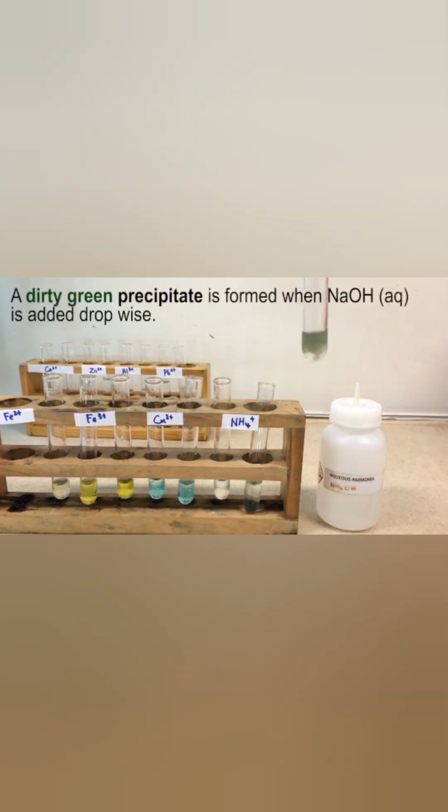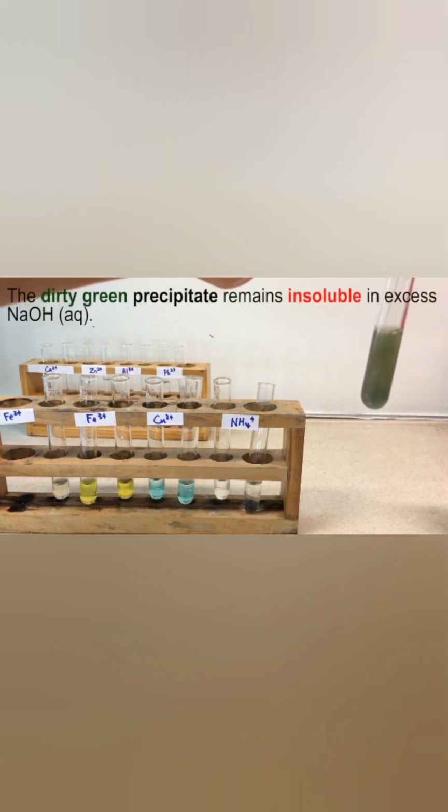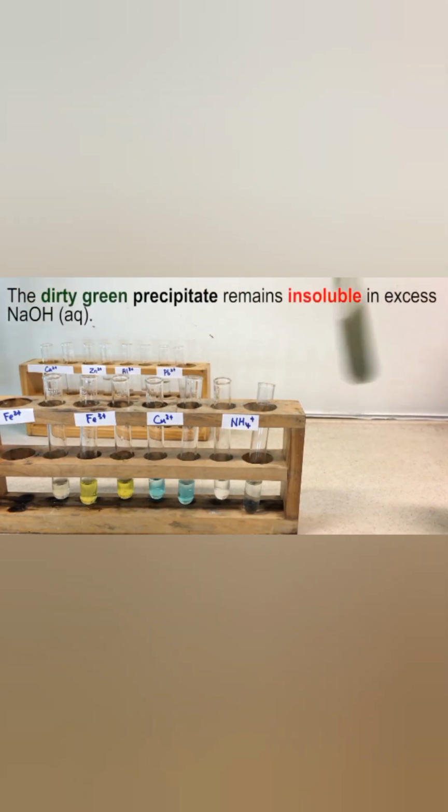Okay, to a solution containing iron 2, a dirty green precipitate is formed when sodium hydroxide is added in drops. You look at it there, a dirty green precipitate is formed. In excess, the precipitate remains insoluble.